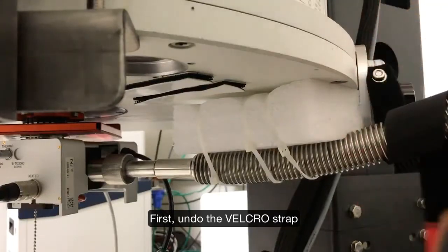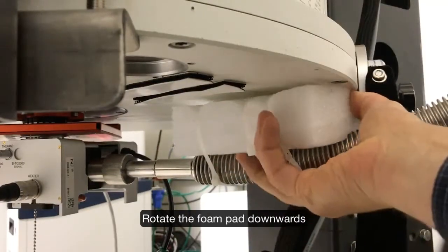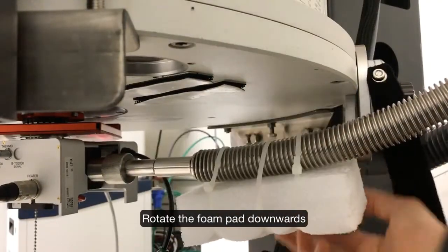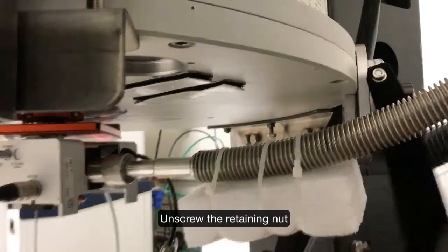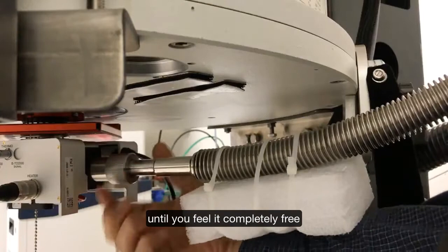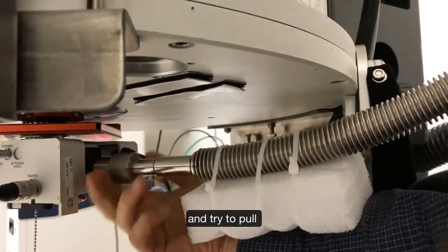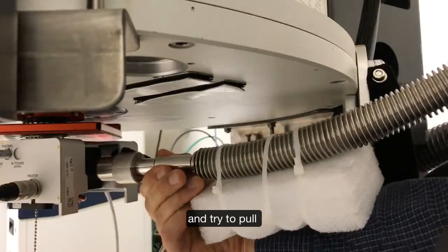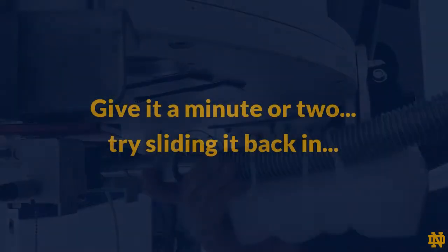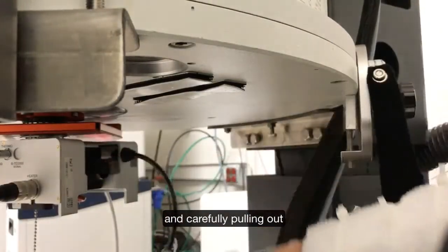We are going to undo the velcro strap, then drop and rotate the foam pad down. Then I can unscrew the nut until I feel it is completely free, and pull the heat exchanger in and then out.